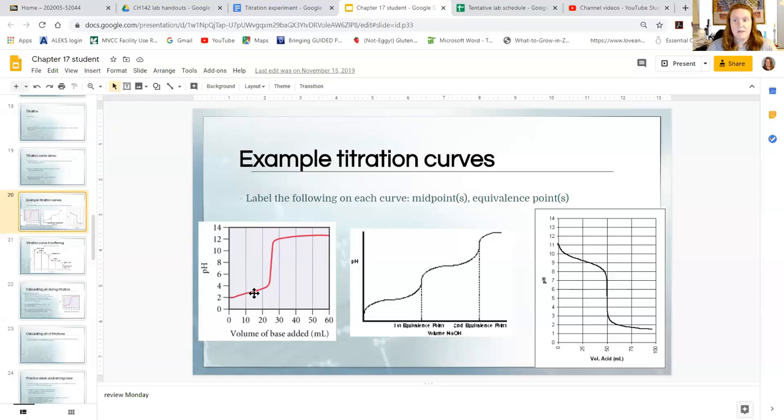Stop and keep the data point in the lab quest. You do that by just clicking the keep button in the lower left corner of the screen. Don't hit the stop button until you have completely generated this whole entire S shape. The stop button means the experiment is over. Keep allows you to make each and every data point. And so in the beginning, you only need to collect about every milliliter.